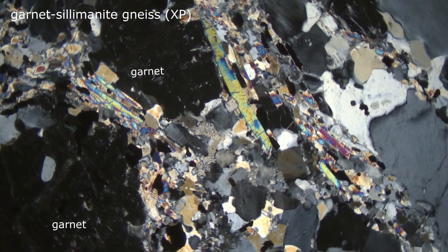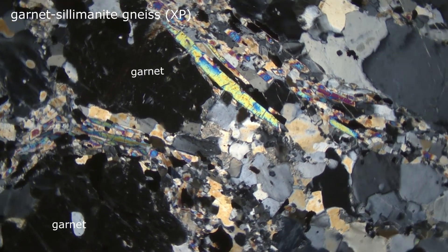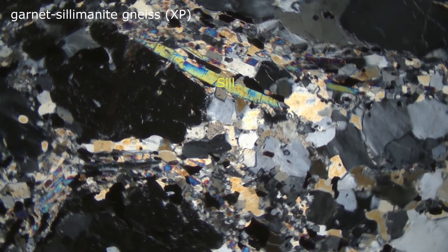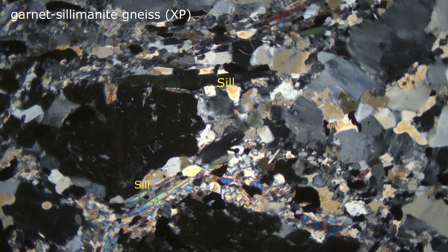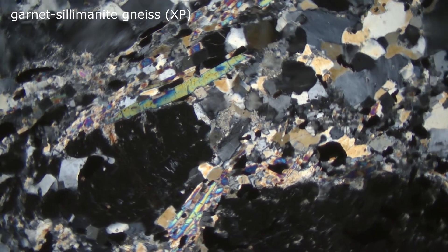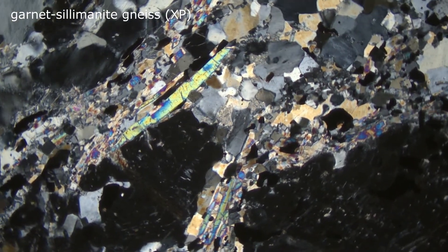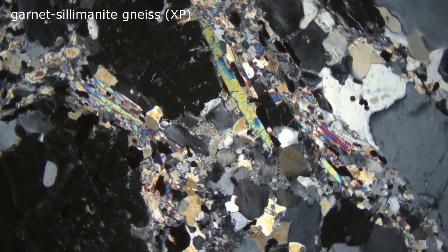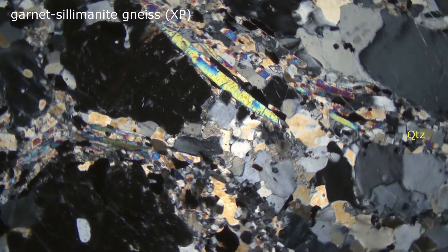The garnet, because it is isotropic, remains black with stage rotation. The sillimanite shows up to second-order interference colors and they change as we rotate the stage. And the quartz and feldspar show their usual white, gray, and black interference colors.